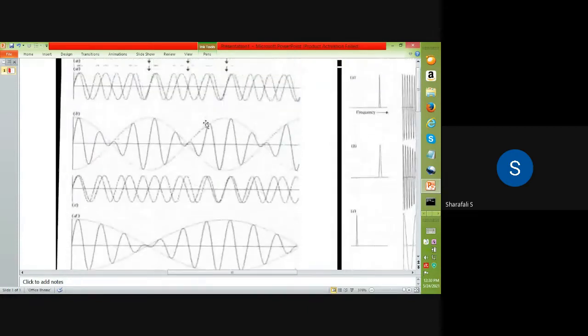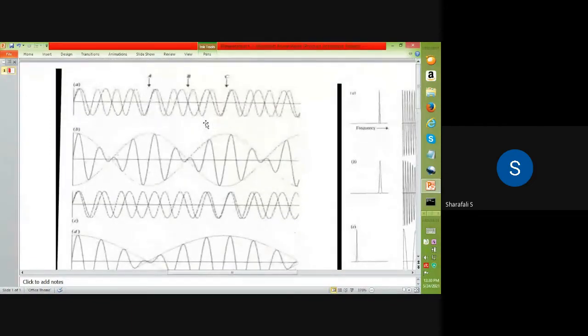So, when you consider the normal IR spectrometer, for example, we have to consider the prism rotation and the rotating grating.